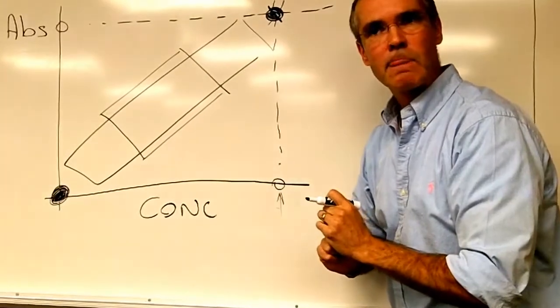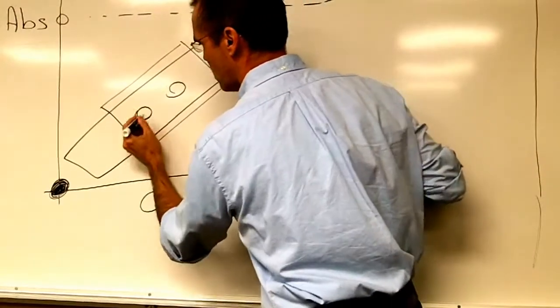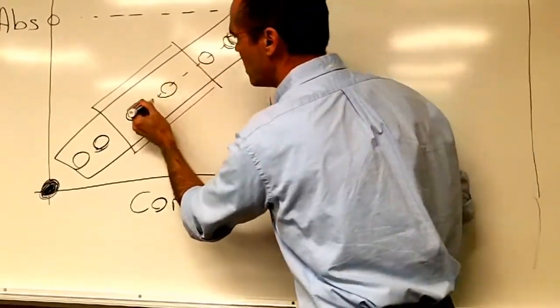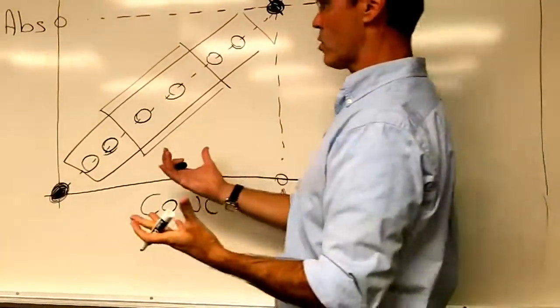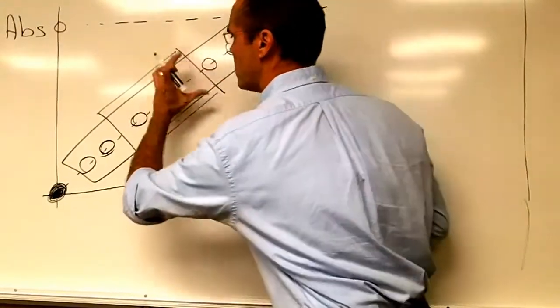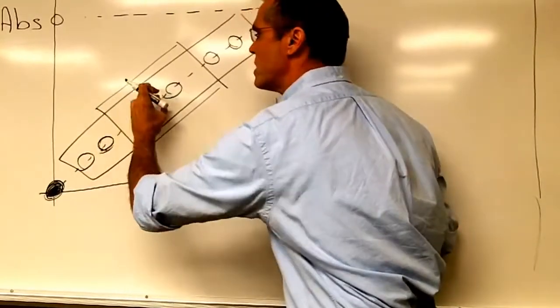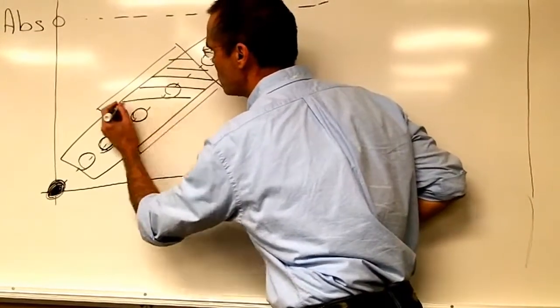Why is that? Because you'll have several data points here, and the more points you have in there on each side, the more precise your line is. And that's in a perfect world. Of course, we are not living in a perfect world. So these points are actually here and there. They're around this trend line there. They're not exactly on the line, but they should be as close as possible. Okay, so your unknown should be around there.